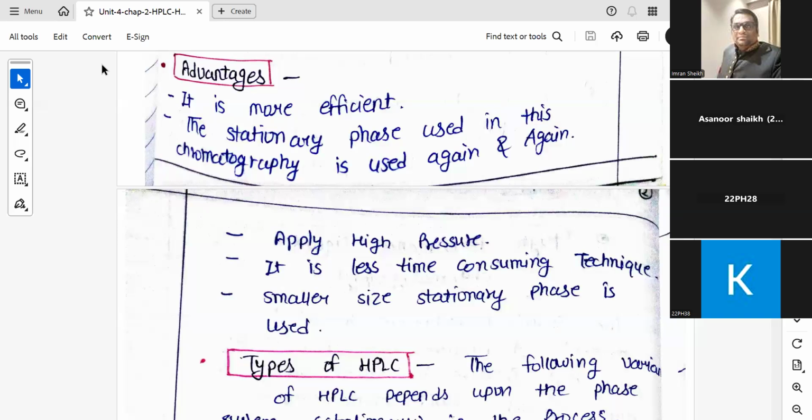And for washing the system, you need not keep a mug with distilled water and wash the HPLC. That's not the case. Here you have to do only one thing: just push the purging button. The purging of the internal system happens automatically.